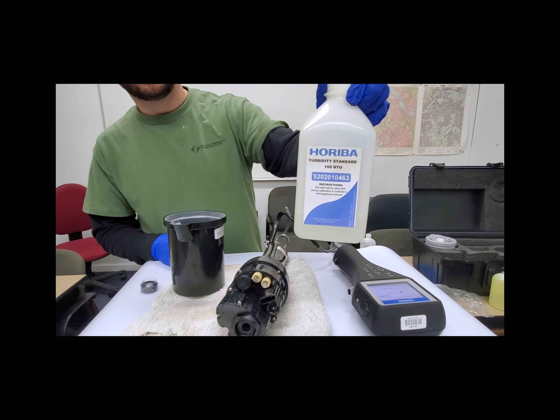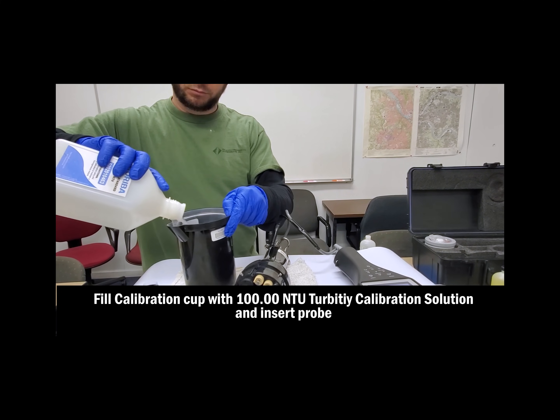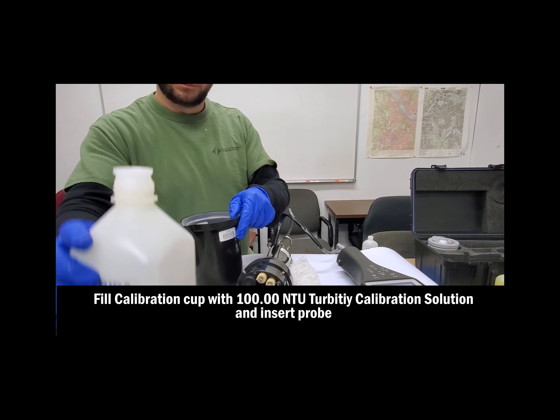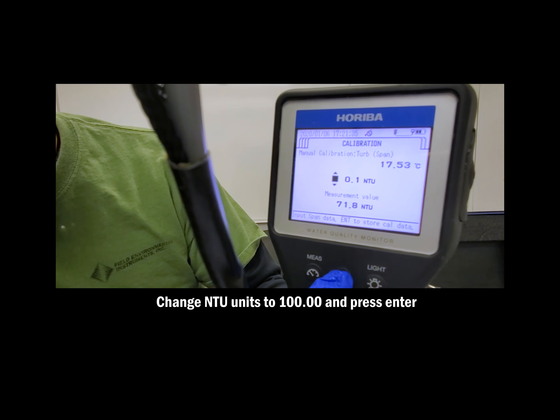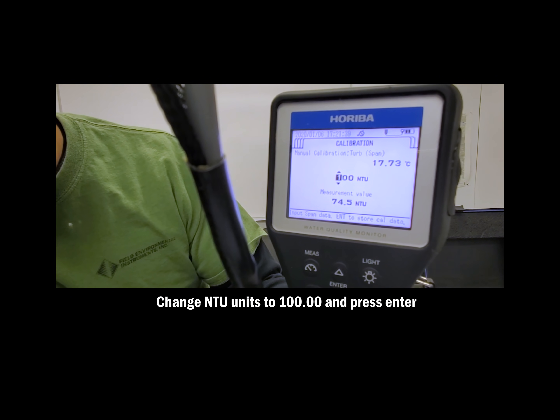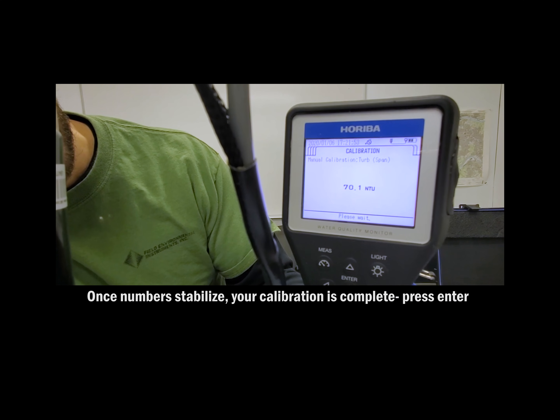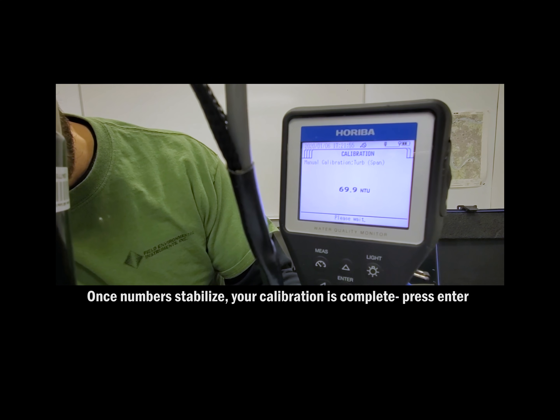Next, we're going to calibrate the 100.00 NTU turbidity value. Pour your solution into the cup and insert your probe. This solution should be very murky as it is 100.00 NTU. As before, choose a manual calibration for turbidity and make the value 100 NTU. Once the numbers have stabilized, you can move on to the next step and dump out your solution.